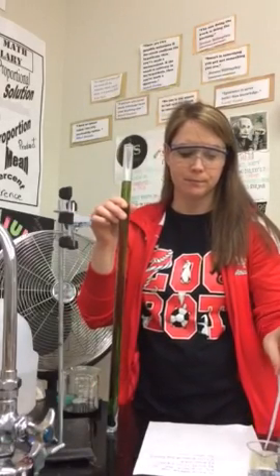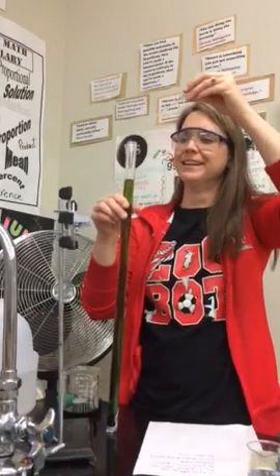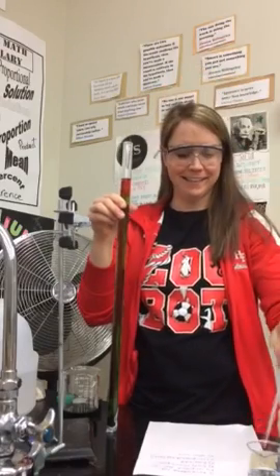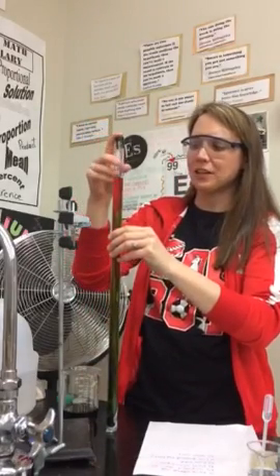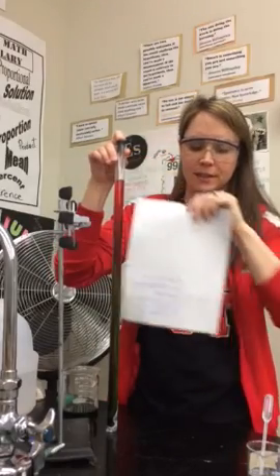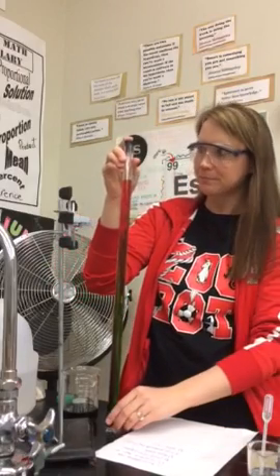Pause the video. Okay. So now, what type of solution did I just add to the tube? You can see the color now. Use your universal indicator color chart. Okay, now pause the video. Give them time to write.